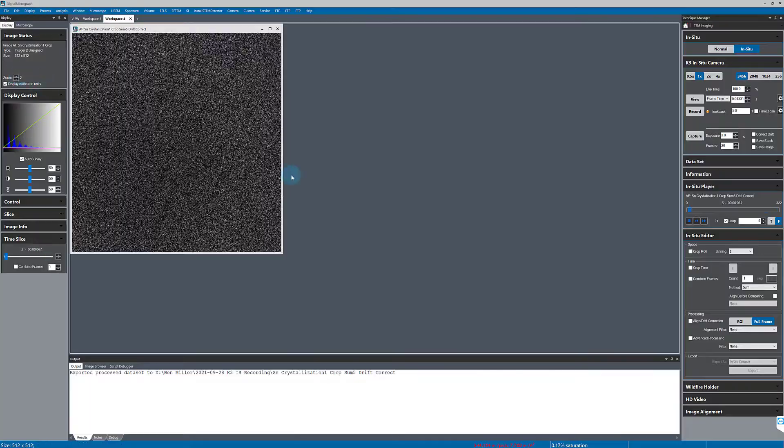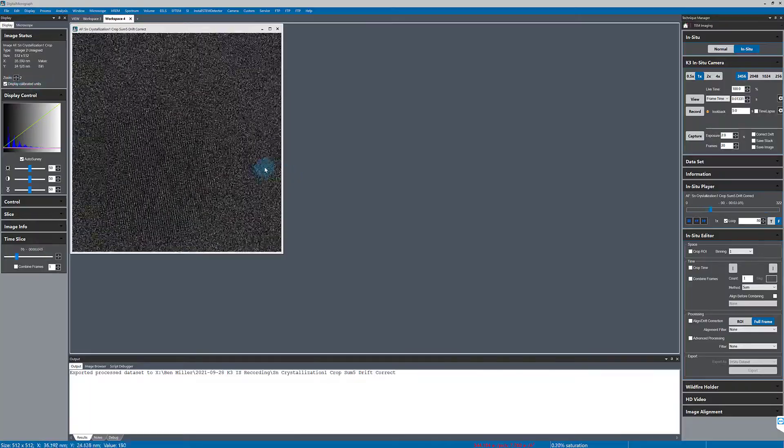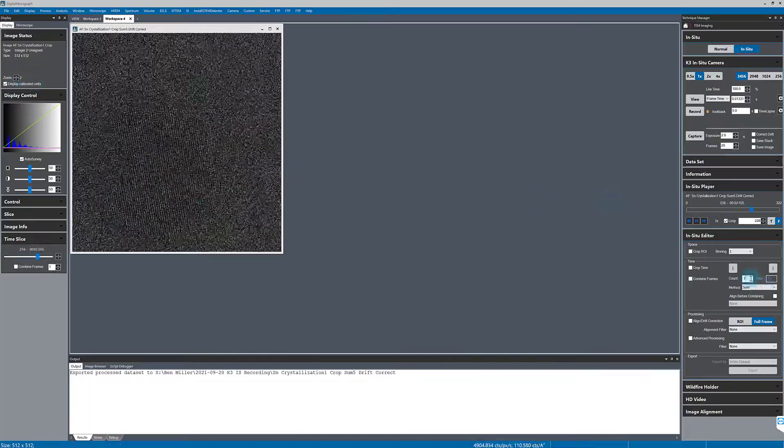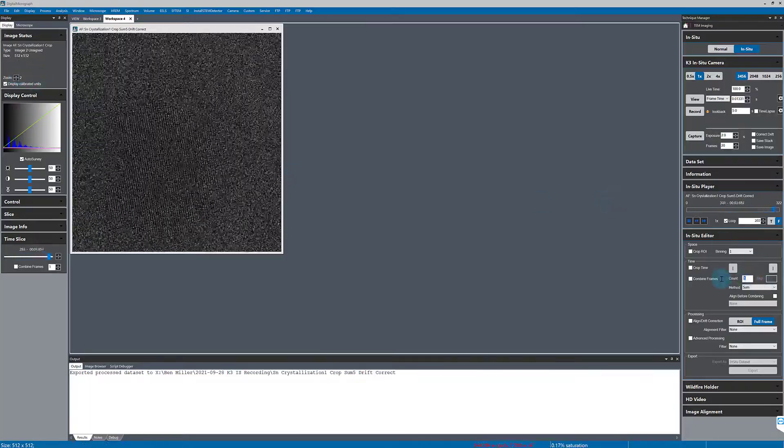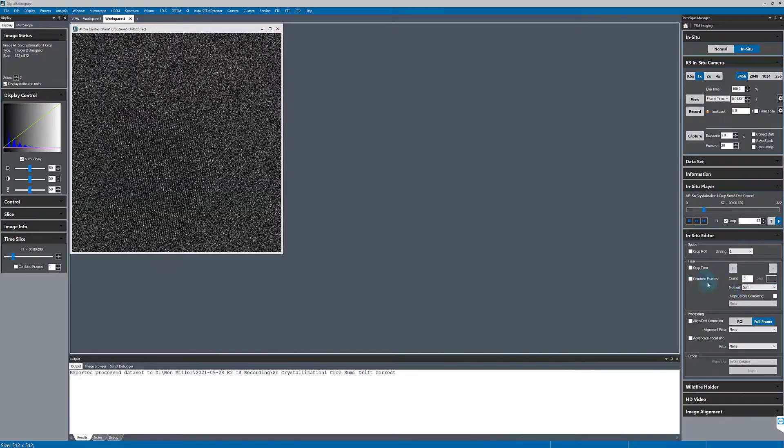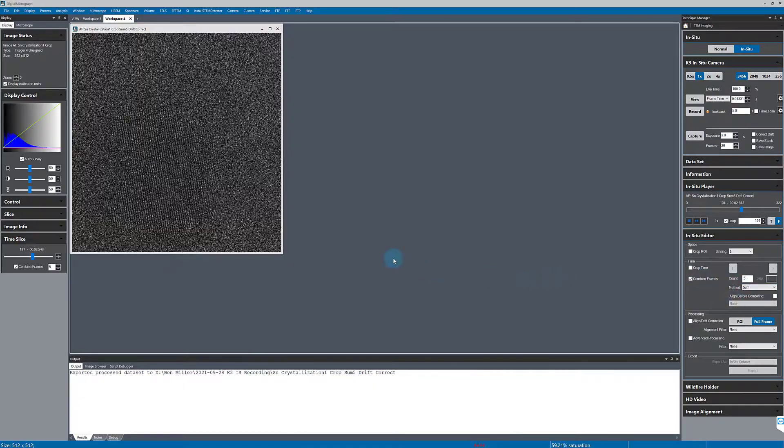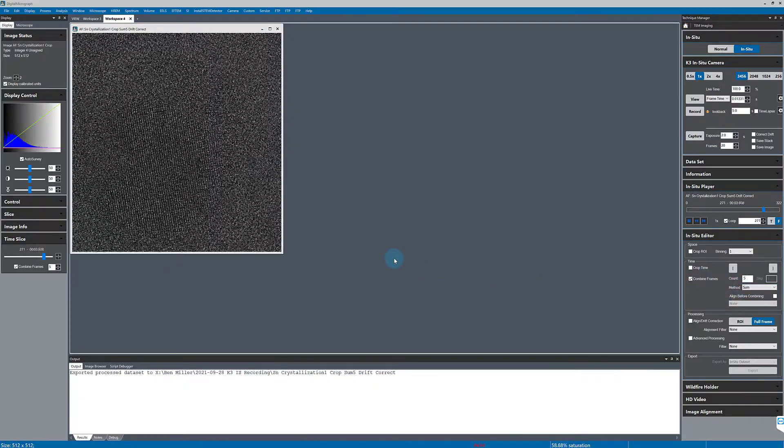I can see right at the beginning that it's not crystalline, it's melted, and then I can see the crystallization take place.